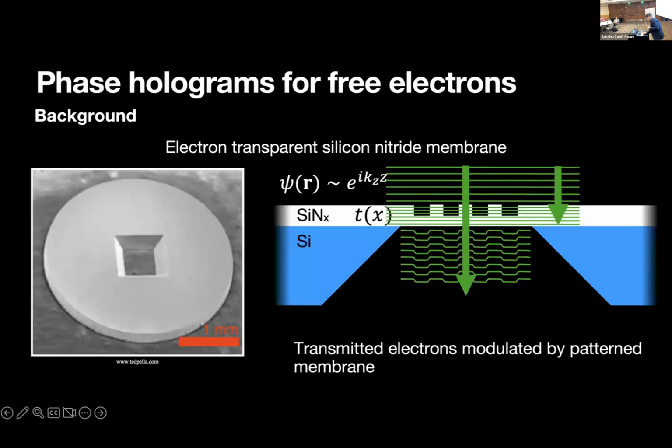There's many others. One kind of simplistic technology to do this is you could use a hologram, a diffraction hologram. So we do this using a piece of glass. We don't have a spatial light modulator for electrons. We have glass, essentially. Inside this little silicon wafer, it's like 3 millimeters across, not 30, not 300, there's a square window. And that glass pane in that square window is silicon nitride. And so what we do is we mill grooves, a pattern, into that silicon nitride.